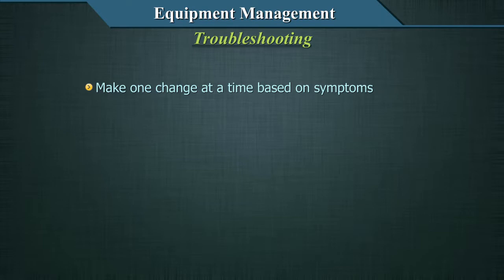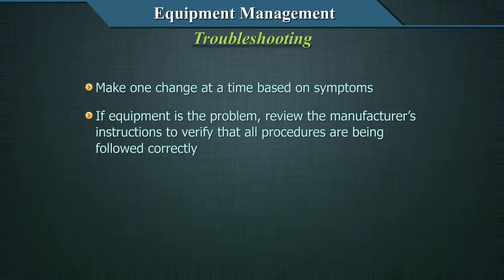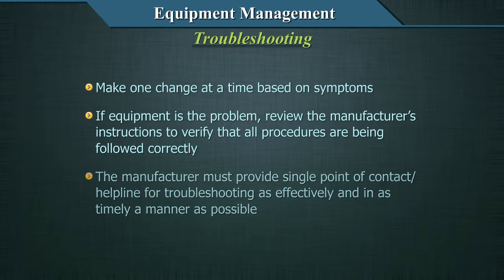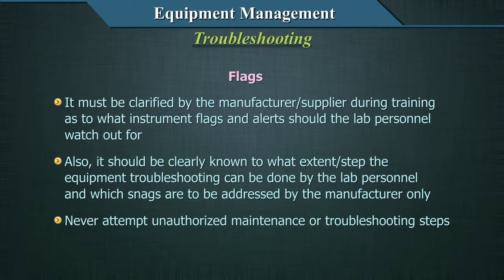Make one change at a time based on symptoms. If equipment is a problem, review the manufacturer's instructions to verify that all procedures are being followed correctly. The manufacturer must provide a single point of contact or helpline for troubleshooting as effectively and in as timely a manner as possible. It must be clarified by the manufacturer or supplier during training as to what instrument flags and alerts lab personnel should watch out for, and to what extent troubleshooting can be done by lab personnel versus what must be addressed by the manufacturer only.